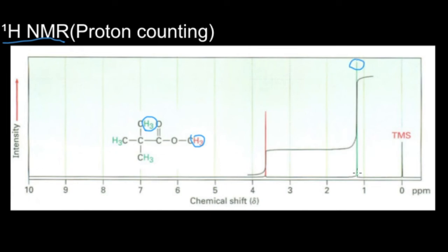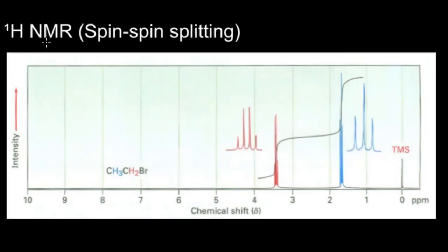It means getting the area under this peak and comparing it with the area under this peak. So let's denote it as A1 and divide it by A2, which comes from here, and you can see that it equals 3. That means that the number of red atoms is 3 times less than the number of green atoms, which is exactly what we expected to get.